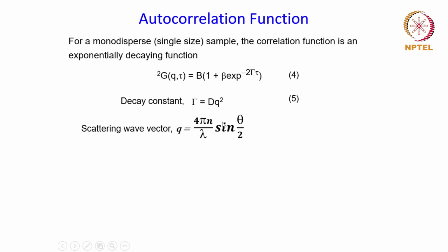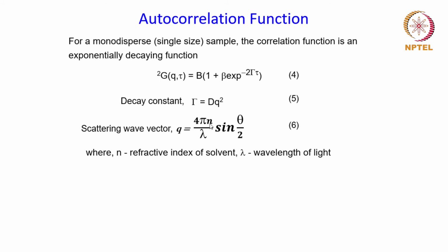Okay, and the other term that you see over here, that is N, that is the refractive index of the solvent, which is being used to disperse the particles.